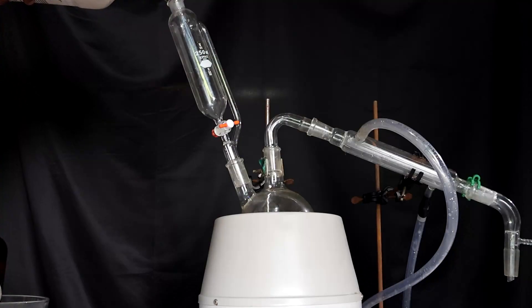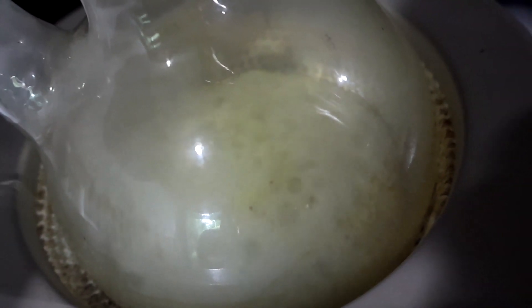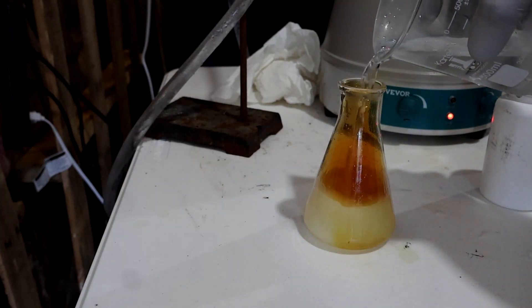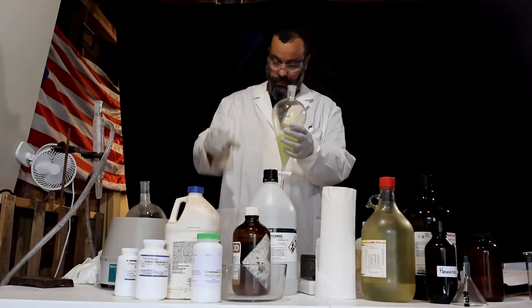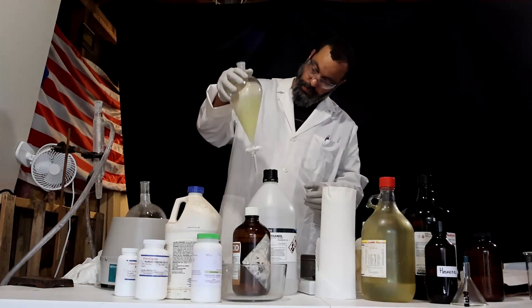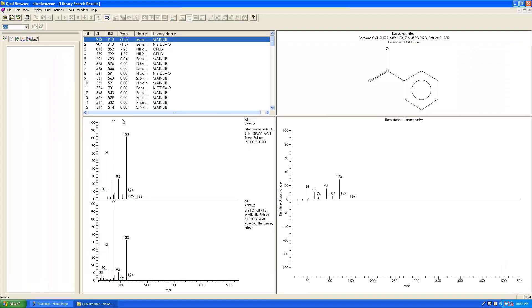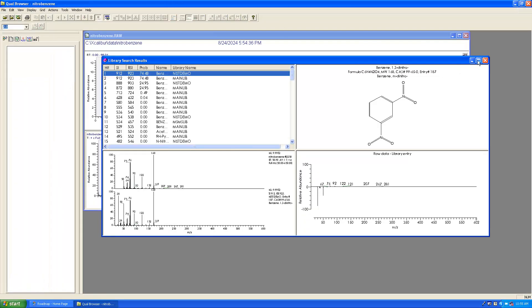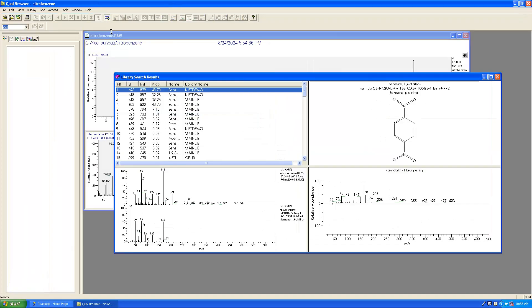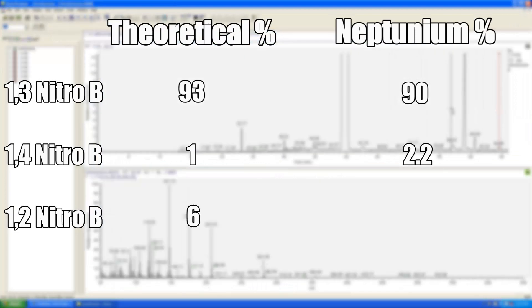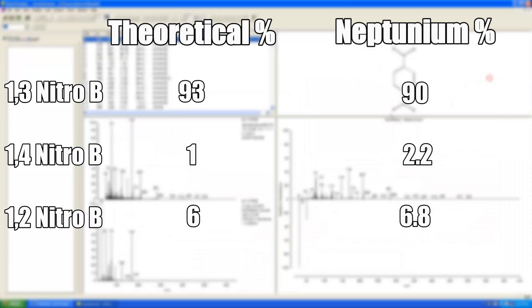Speaking of benzene, I wanted to demonstrate the nitration ratio quantitatively, so I set up a round bottom flask with a bit of sulfuric and nitric acid to which I added a small amount of benzene. I left it to react at room temperature for a few minutes before adding cold water. I extracted the organic phase using DCM, and here are the results on the GC-MS. There is still a very small amount of unreacted benzene. The very large hump here is our main product, nitrobenzene. But there is also some side reaction happening — meta-dinitrobenzene was formed along with the ortho and para-dinitrobenzene.